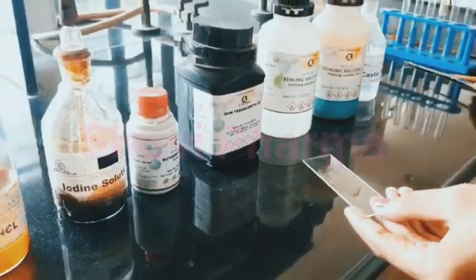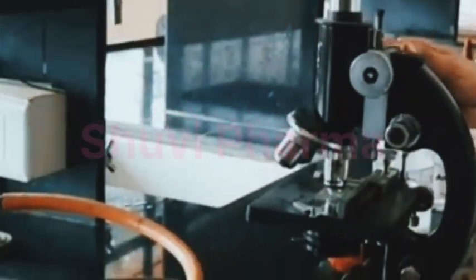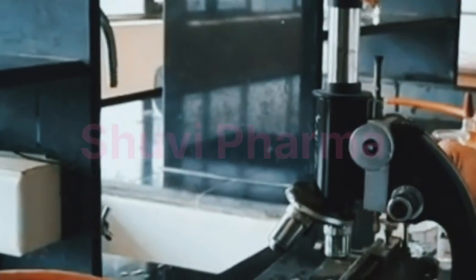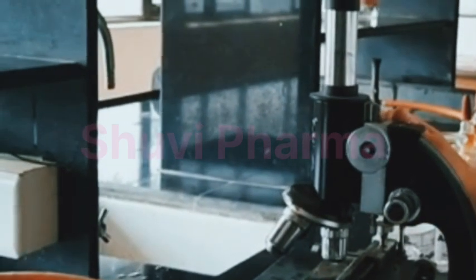And now we will observe this slide under the microscope. Under the microscope, pink color crystals are observed that indicates the presence of tragacanth.